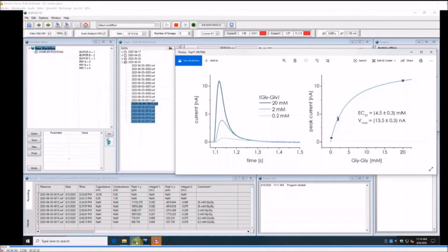And then a secondary question, what was the activation solution for cardiomyocytes? Or were all other transporters excluded from the assay? So the buffers used for the cardiomyocyte experiments were very basic. They basically only contained sodium for the internal buffer and sorbitol or potassium for the external buffers. And that is actually also the reason why so little other activities are observed.